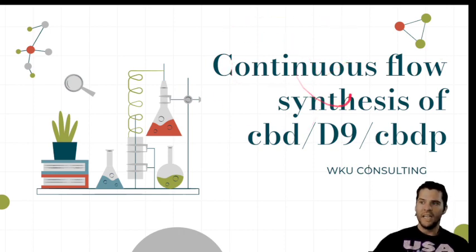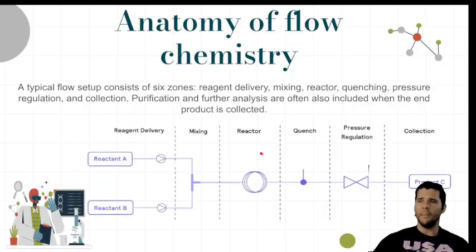I promise. Continuous flow synthesis of CBD, Delta 9, and CBDP. And this could also go for CBDM, CBDB, and all the THC derivatives thereof just by substituting a simple molecule. I'm not even playing. I am Grim from WKU.